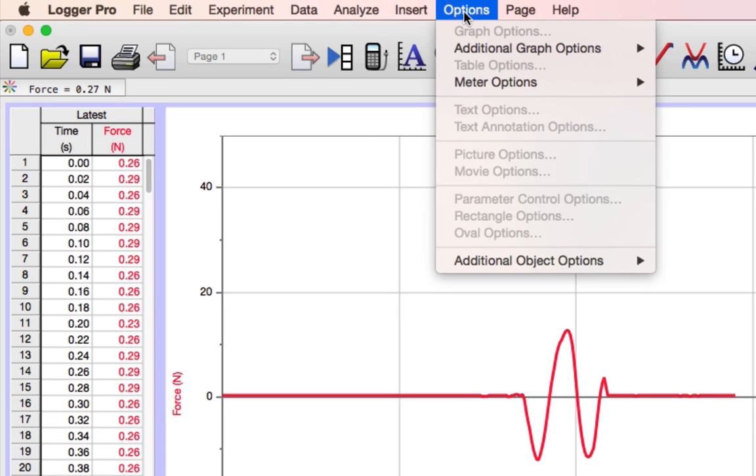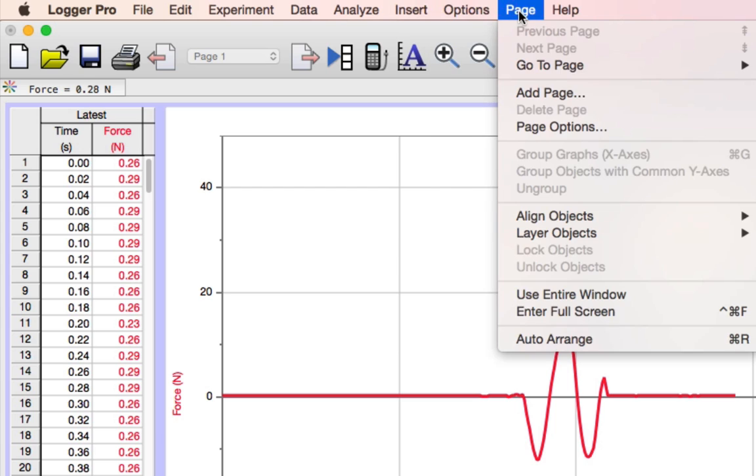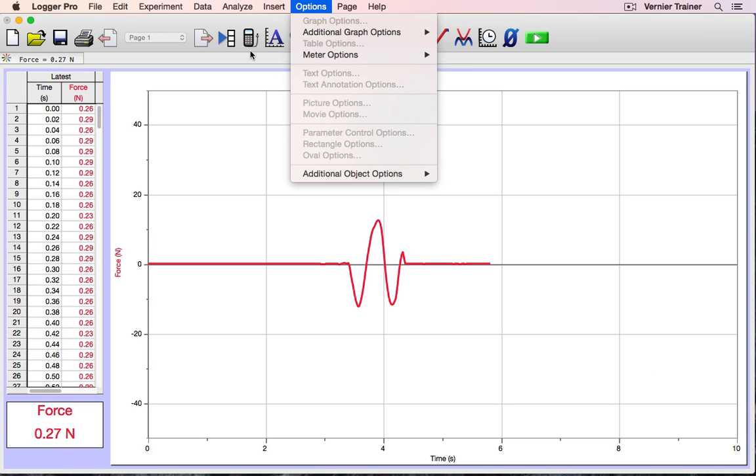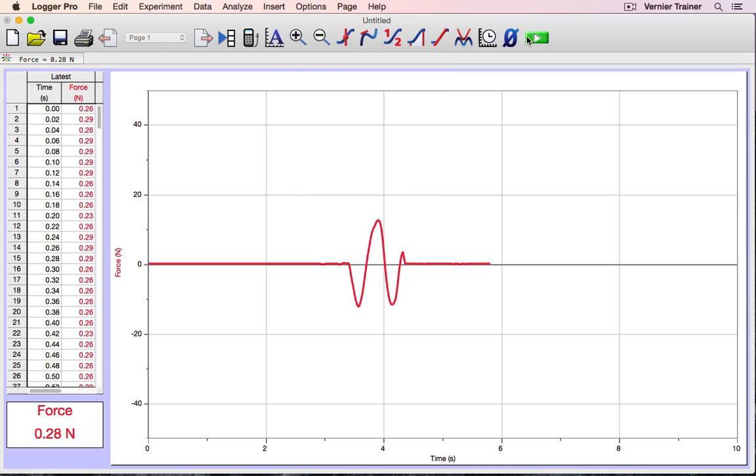Beneath that, I have a row of shortcut buttons that give me quick access to the features in Logger Pro that I'll use most frequently.